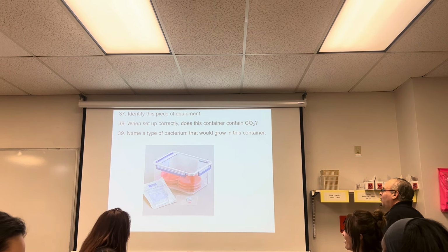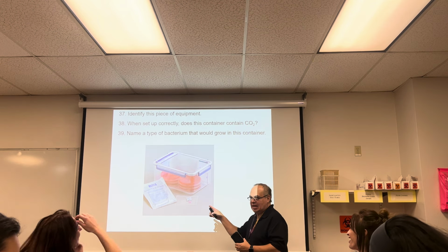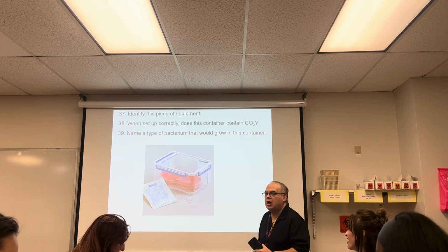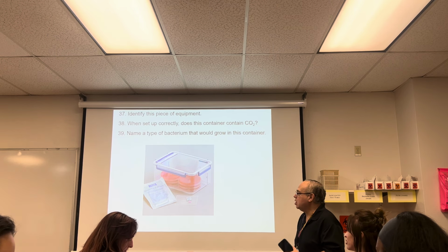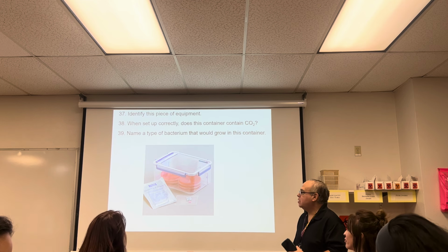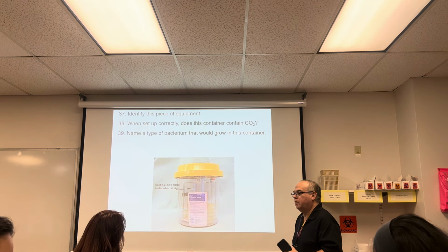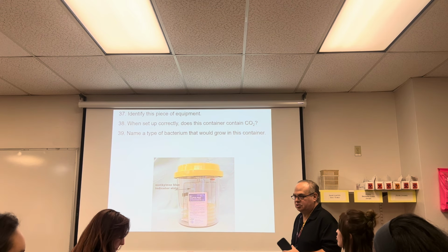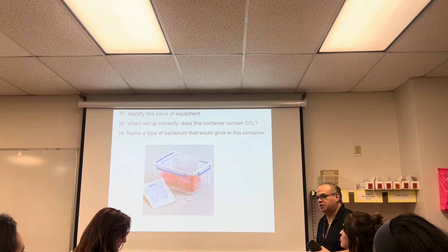Not, if you put Tupperware, it's gonna be wrong. This is the anaerobic container. Okay? Now, I teach at different campuses. Here we use this. No, gas pack is something different. This is an anaerobic chamber. This is an anaerobic jar. I use these at HLC when I go over there. Okay? But let's just stay here because this is what we use here.